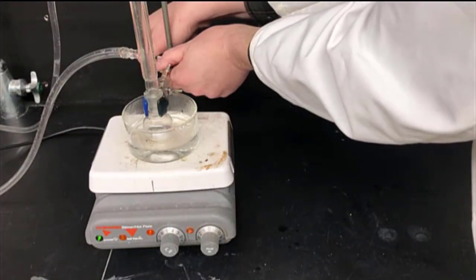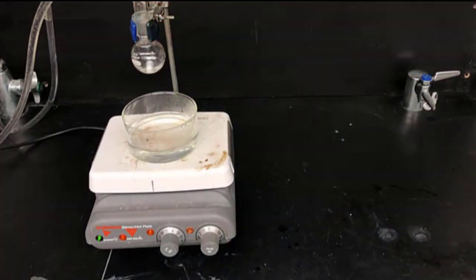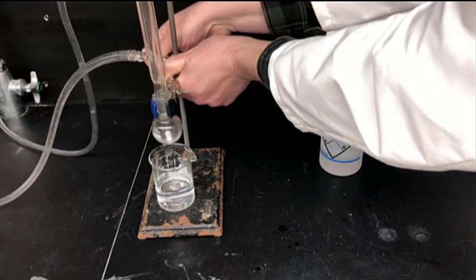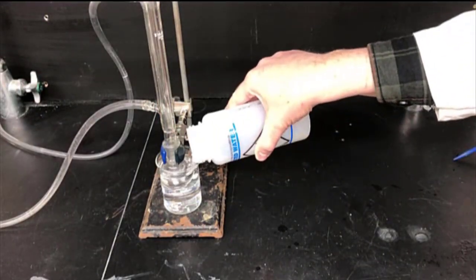After refluxing for one hour, remove the heat source by taking away the hot water bath, and then we can cool it down to room temperature fairly quickly by replacing the hot water bath with a room temperature water bath. This will get the reaction temperature down to near room temperature very quickly.